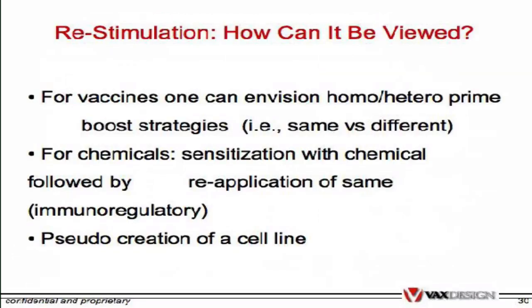We can look at chemical sensitizers. Many chemicals that are used in cosmetic industry and perfume industry, there's a high degree of interest in whether these are sensitizing or not, allergenic. Hypersensitivities, type 1 and type 4 hypersensitivity, is an area of our interest as well.